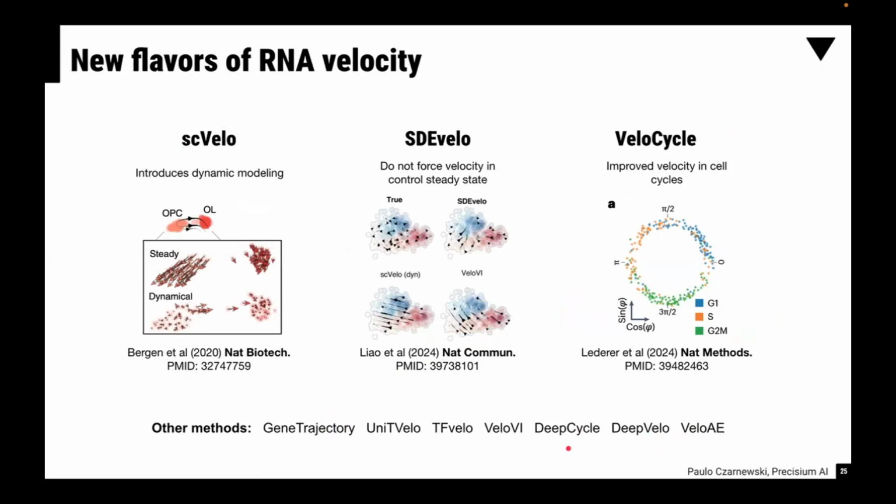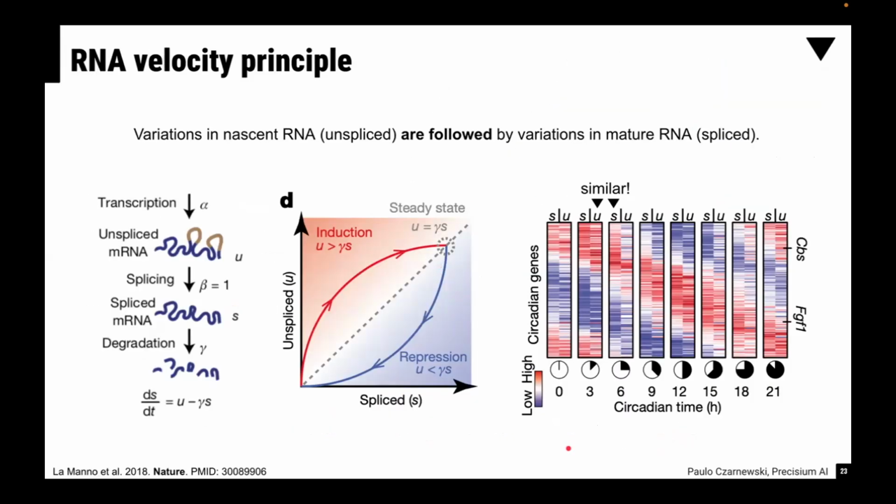I think it's probably far too complex to model, right? Also, if you have a few genes that deviate, that have aberrant splicing, it's still the joint signal from multiple genes that makes you draw these arrows with velocities. So hopefully it should be fine.